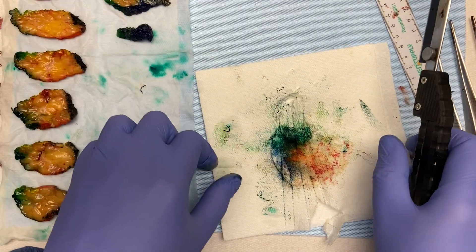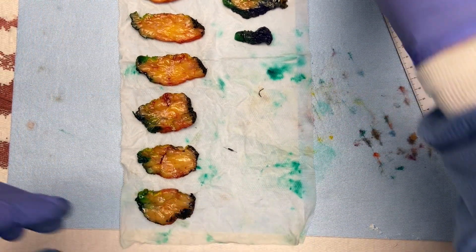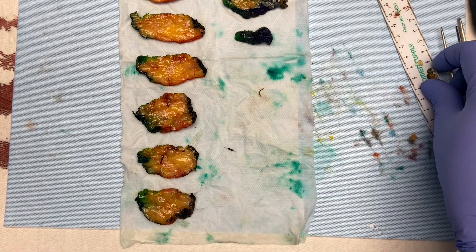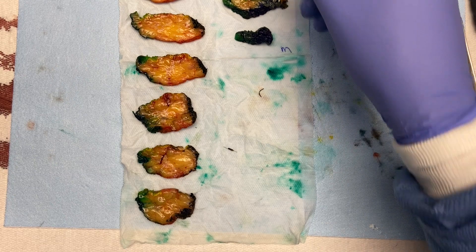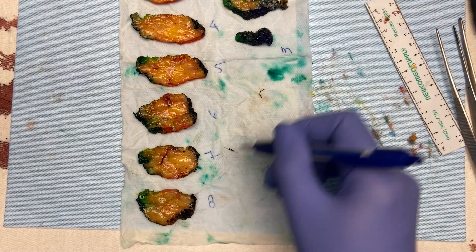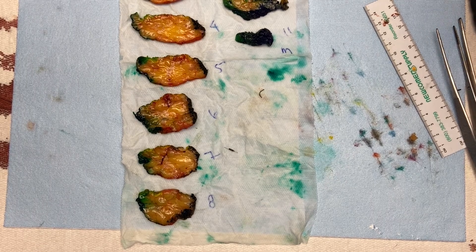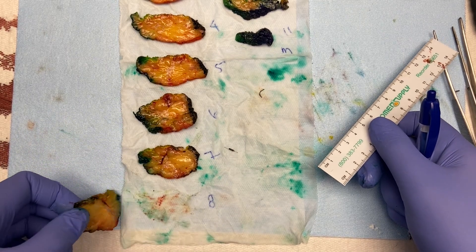I've laid the specimen out systematically so everything is oriented the same way. I'll eventually flip some of these to see more of the mass on the other side, but for now we keep it like this. We went lateral to medial and I'll number the slices on the paper towel — it makes it easy when doing your sections and notes. I did 11 slices total, lateral to medial, and we have mass in slices five, six, seven, and a little bit in eight.